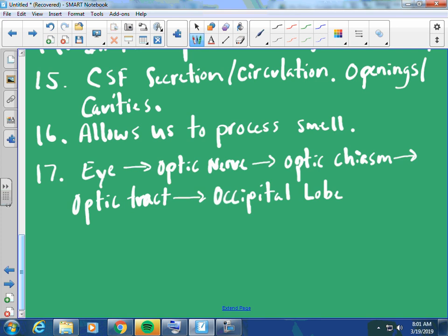And the last one was actually supposed to say pituitary gland, not pineal. Okay, so where's the pituitary gland? How would we say its location? What did you say about it? How do you find it? Would you put superior to the pons? It's kind of a little bit. I'd say it's more in front of it, wouldn't you?